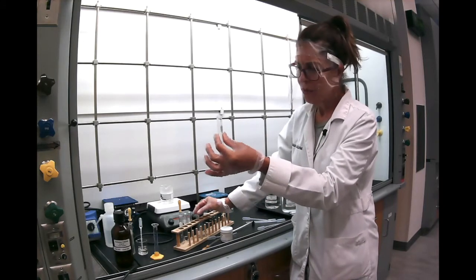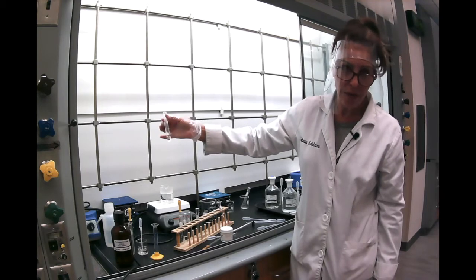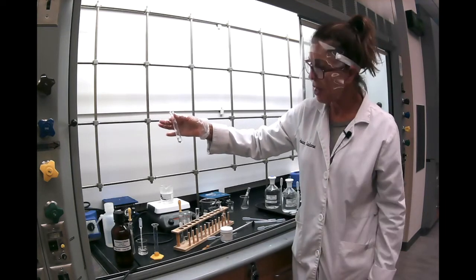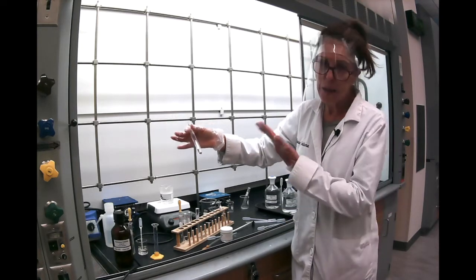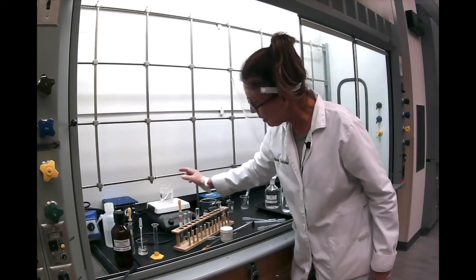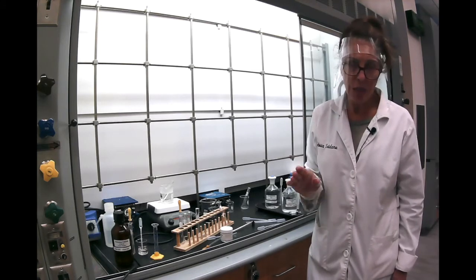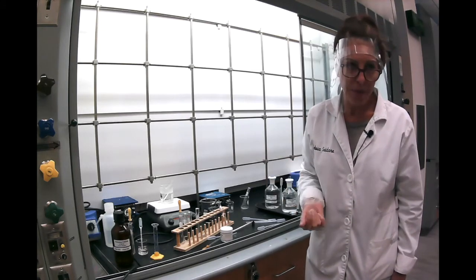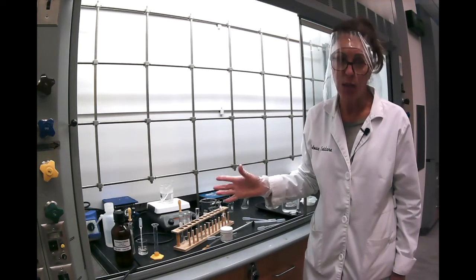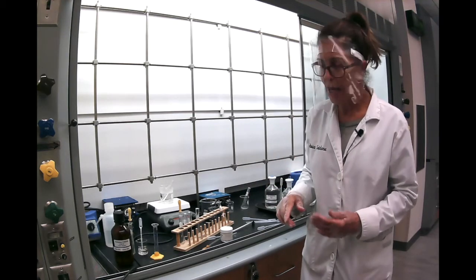So now, here's my test tube with the organic layer, which is methylene chloride, and we want to see how much benzoic acid is in there. So all I have to do is evaporate all the solvent and then weigh it. So I'm going to put it here in that beaker, and while it's doing its work, we're going to start with the active extraction. So this was the passive, meaning that there is no chemical reaction involved. It's just dissolving the benzoic acid between the two layers.